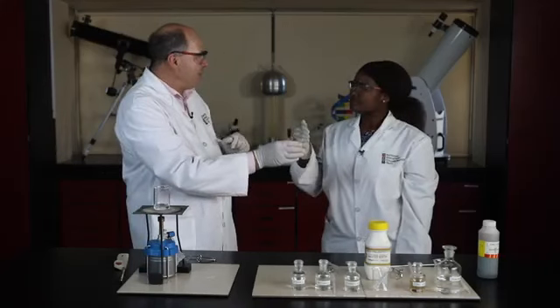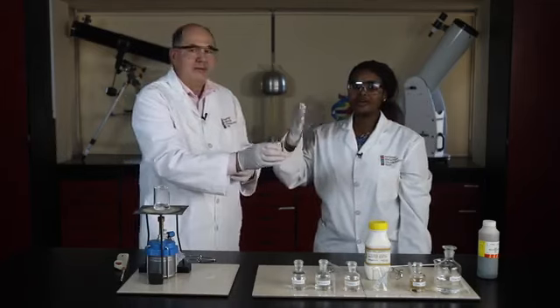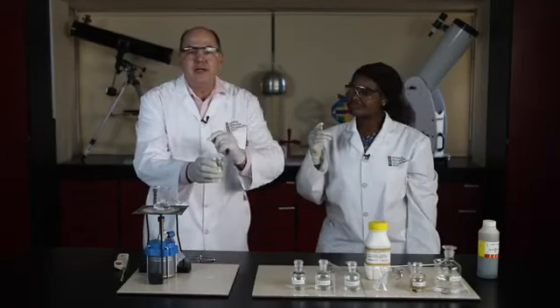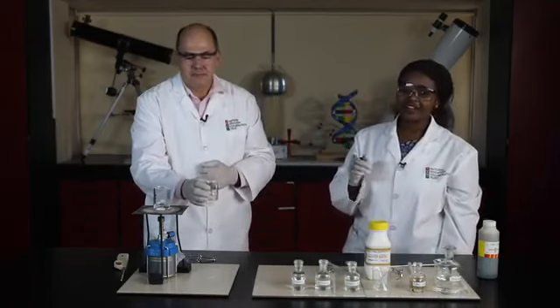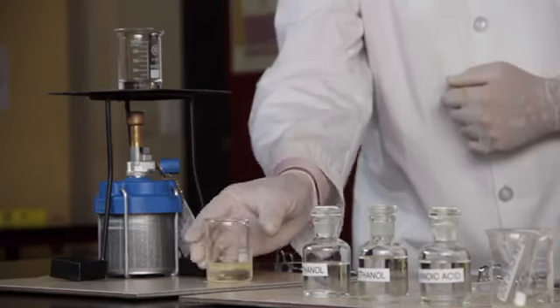You know what it reminds me of? Athletes, the change room. Oh, it's the one that we used to treat sore muscles, as well as sprained ankles. That's right. It's called wintergreen. This is a very pleasant odor. Learners, record the fragrance of this ester formed by the reaction of methanol and salicylic acid.